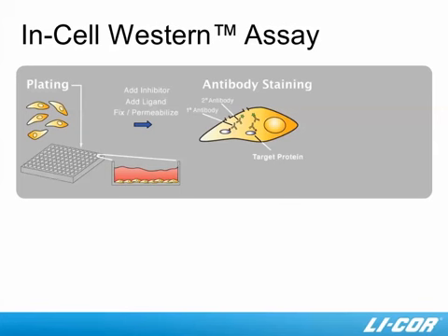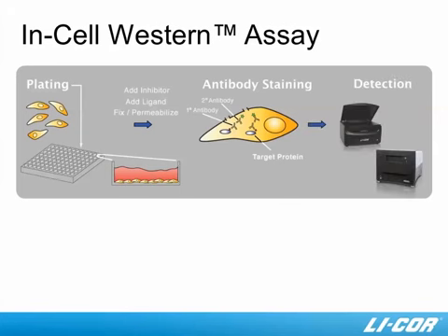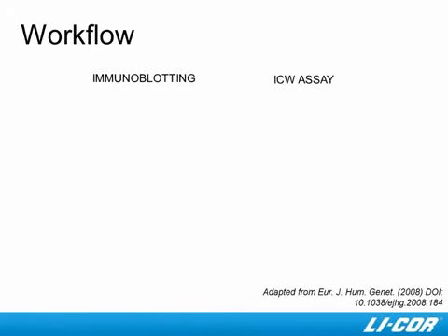Once the cells are permeabilized, you go ahead and add a primary antibody specific for your target of interest. You then add a secondary antibody to detect your primary. Now, what makes these secondaries unique is that they're conjugated to an IR dye. These IR dyes will fluoresce in the infrared wavelengths and allow for detection on an Odyssey imager. So once you're done with the secondary incubation, you go ahead and take the entire plate itself and place it on either an Odyssey Classic, an Odyssey Assay, or an Odyssey CLX, and scan the plate.